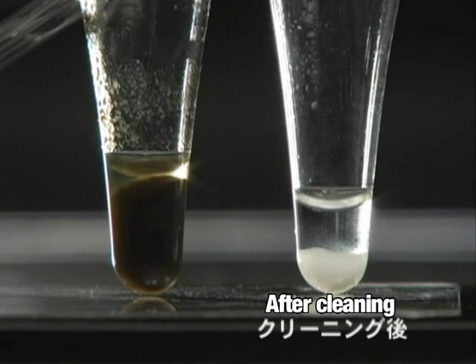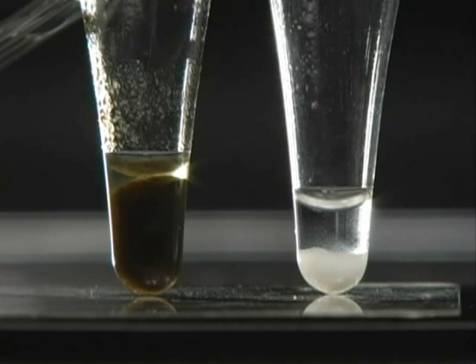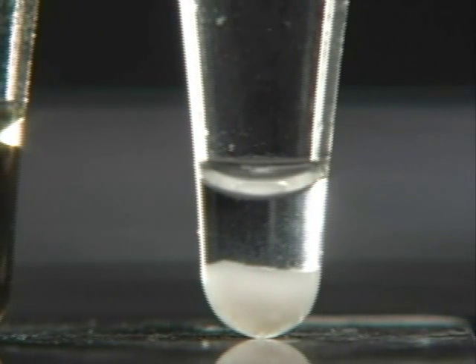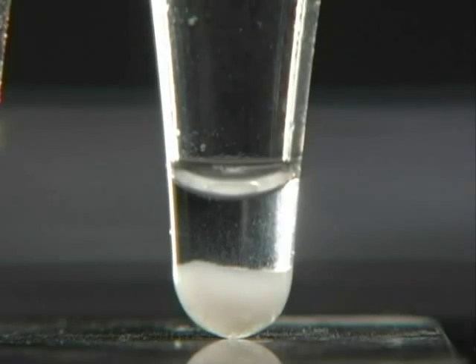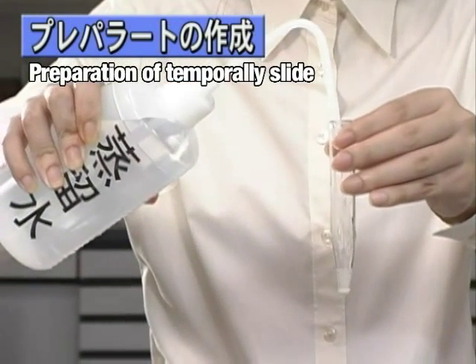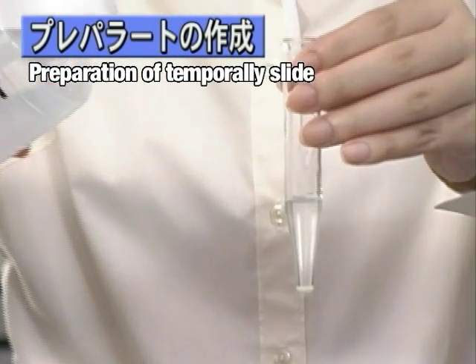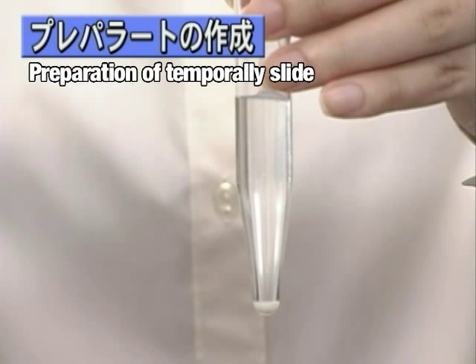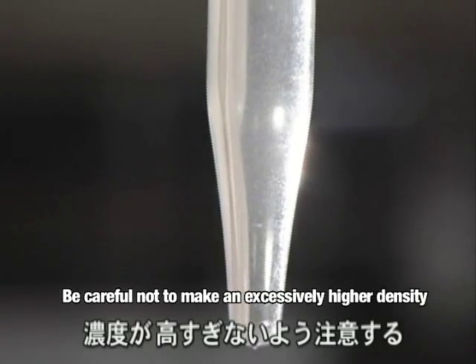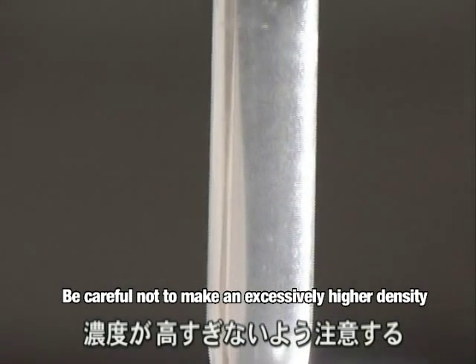When comparing the cleaned diatoms to the original sample, you can see that the cleaned diatoms have become white. Next, we will demonstrate the preparation of slides. To the cleaned diatoms sample, add distilled water until the mixture becomes foggy. This is done to dilute the sample, as a high concentration of diatoms makes observation difficult.